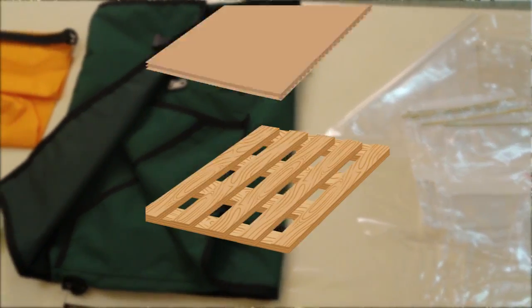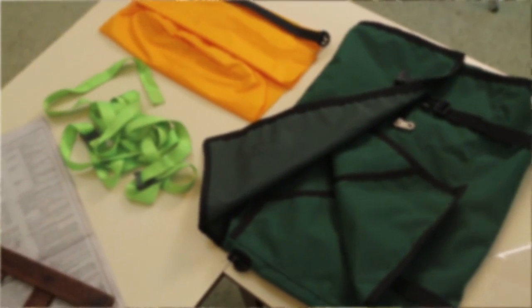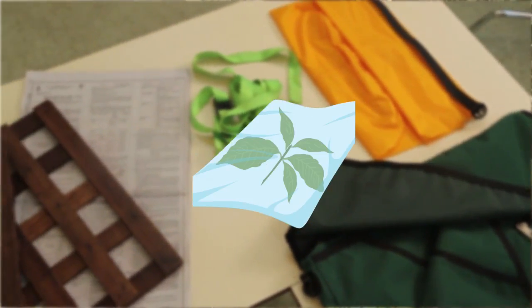Have your specimens? Press them as soon as possible. If you can't, tie them together and put them in plastic bags for alcohol treatment. Otherwise, proceed with the pressing process.